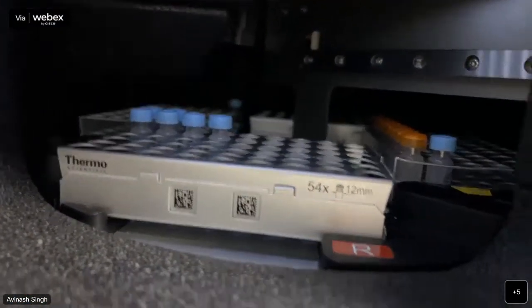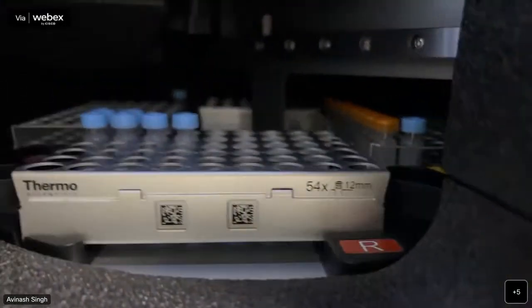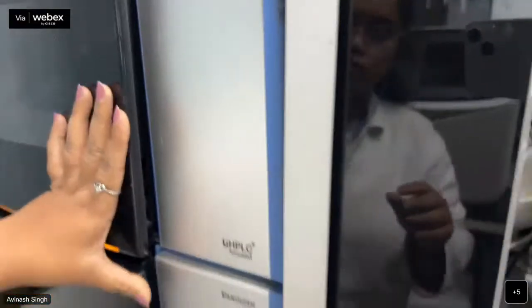After that, this is the autosampler, where we keep our samples. It has many trays, so we keep our samples here for analysis. After that comes the column compartment, so the sample comes to the column compartment. This is the column. Then from this column, the sample goes directly to the mass spectrometer. Here this is the voltage, so samples come directly from here to the mass spectrometer.